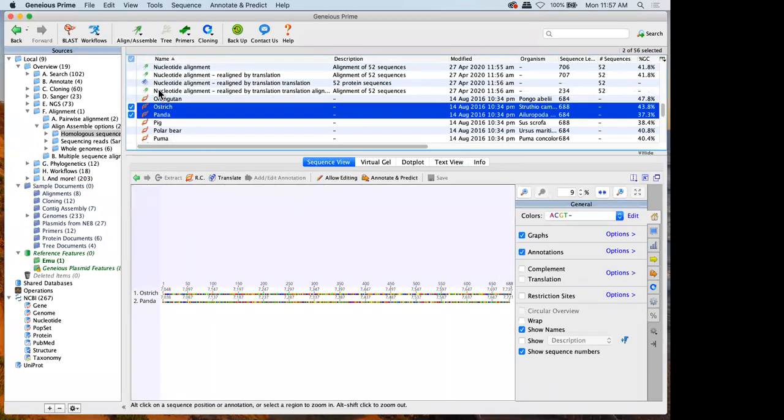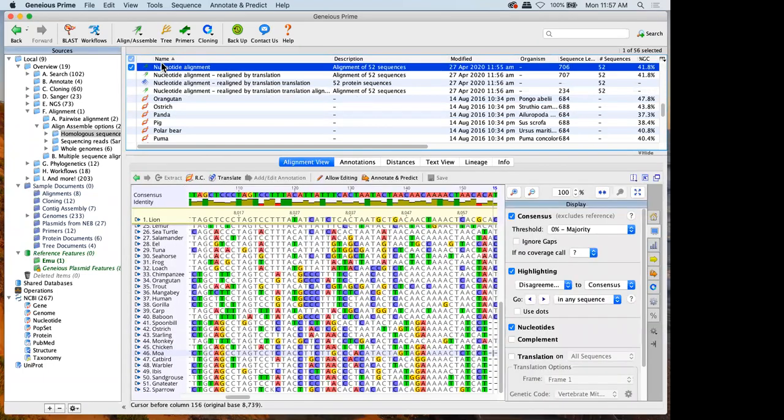So I know one of the things people had asked about was building phylogenetic trees. So I'm going to talk about that next before we circle back to things like NGS. But any questions at this point about multiple sequence alignments or anything else that come to mind? Okay. Like I said, hopefully I'm not cutting anybody off. Do speak up if you're struggling to find that mute button there, or send it through the chat function.